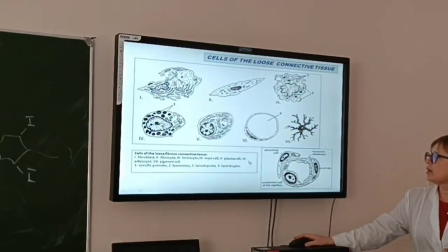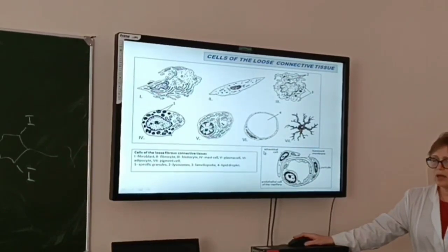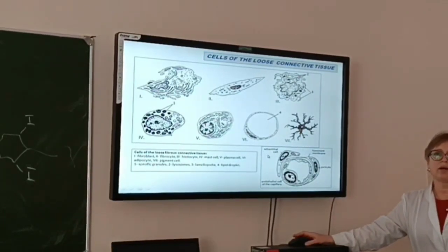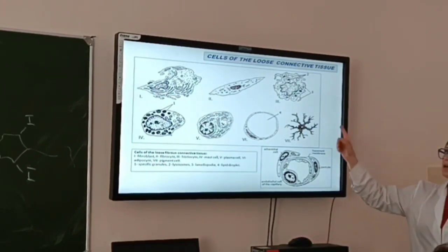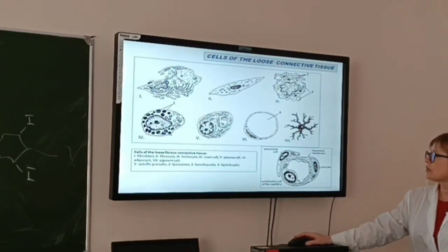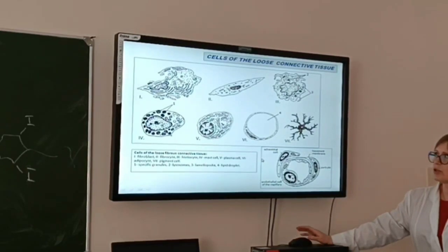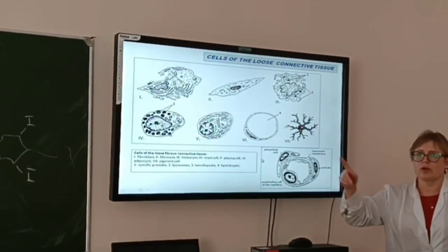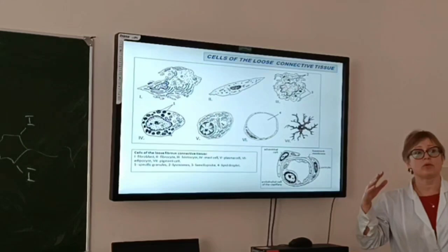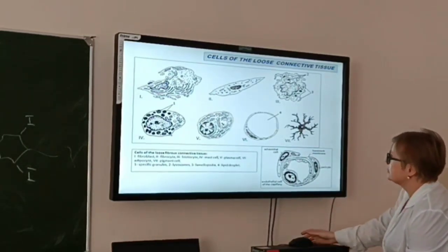And near capillaries, we can also find adventitial cells. This is a precursor cell for different cells of internal tissues. And look, please, the adventitial cell never has a basement membrane. It's important. Cells of connective tissue have no basement membrane because they are mobile. In the tissue they can travel along.